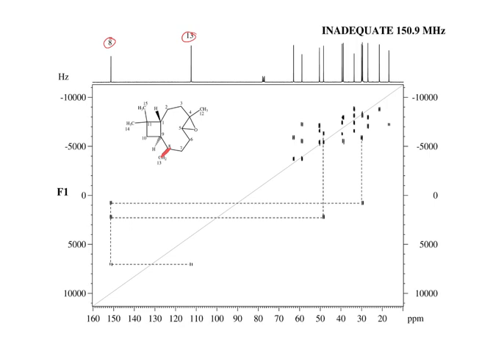It wasn't my project, but one of the other postdocs had this one, and they decided that they were going to do an INADEQUATE on it. They had to run that spectrum for at least 1 week. I don't know if it was even longer than that. It was really long because it was so insensitive.